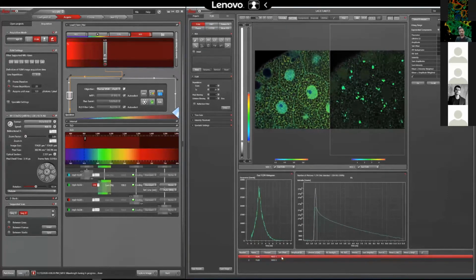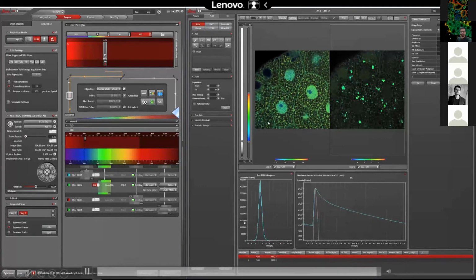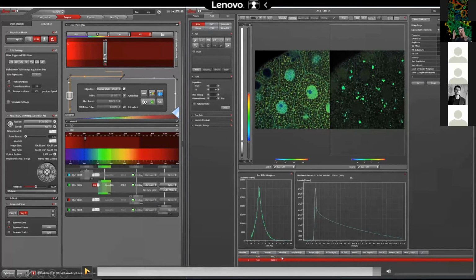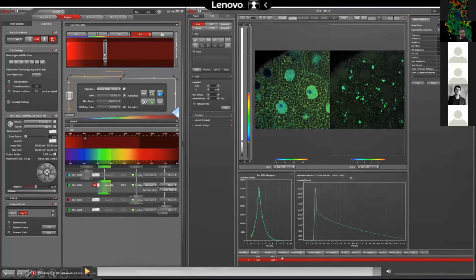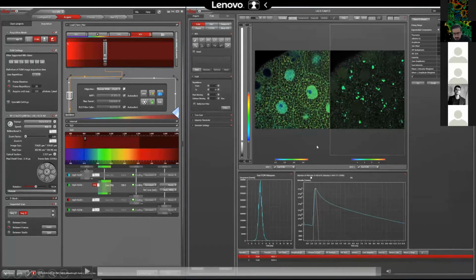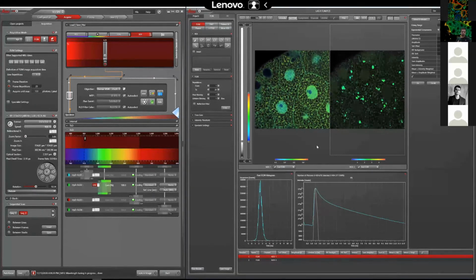For FAD, where we have fewer counts, it's more broad. For NADH, where we have almost the proper number of photons per field of view, about 8 million in this field of view, we have a more defined fast FLIM histogram.